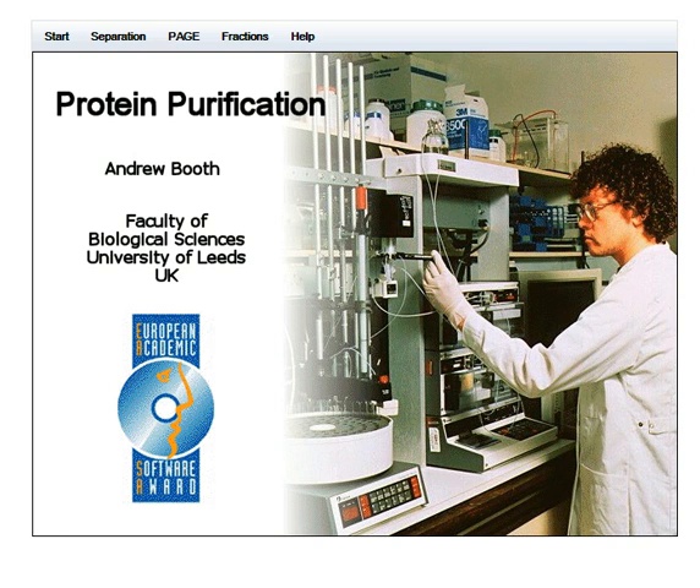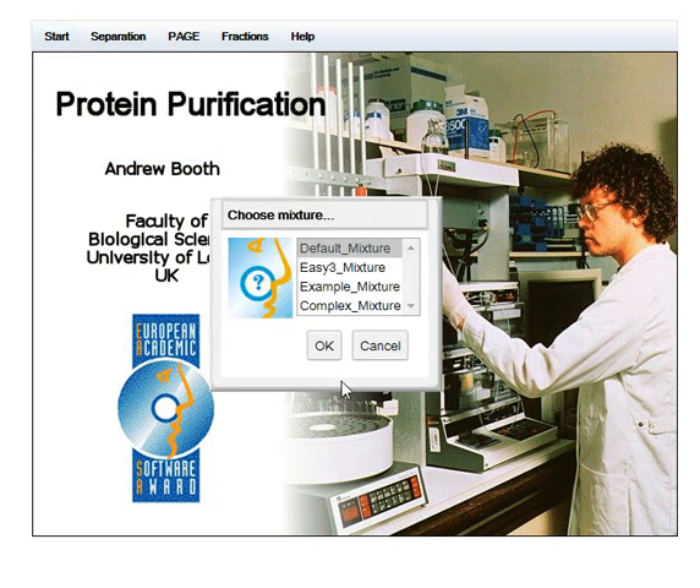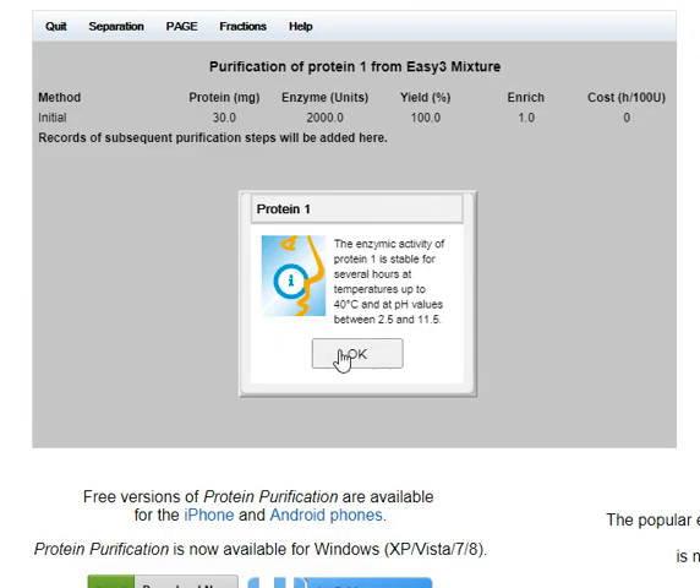This is a virtual protein purification software — a very useful training exercise. I spent some time understanding the basics, but I'm going to edit down for the sake of this demonstration. There are several levels of protein mixtures. Looking at the easy one first, there are three proteins. I'll go for protein one. There's information about pH and temperature, so it would be better to work at a lower temperature.